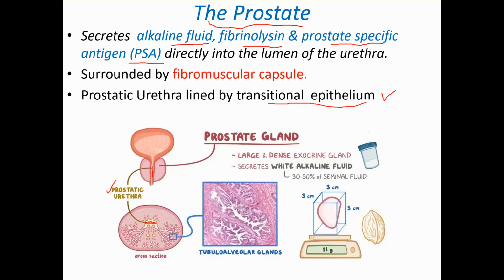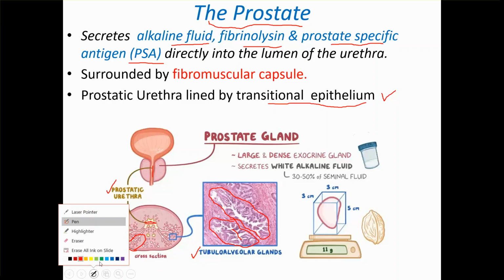Okay, now also you can see that there are a lot of glands. What you're seeing here, these are glands. These are called tubulo-alveolar glands. You can see the section is shown here. The white area which you're seeing is actually the lumen of the gland. It gives a kind of flowery appearance between the glands. This is one set of glands over here, and then there's another set over here. Between the glands you have the pink colored structure, which is called the fibromuscular stroma.